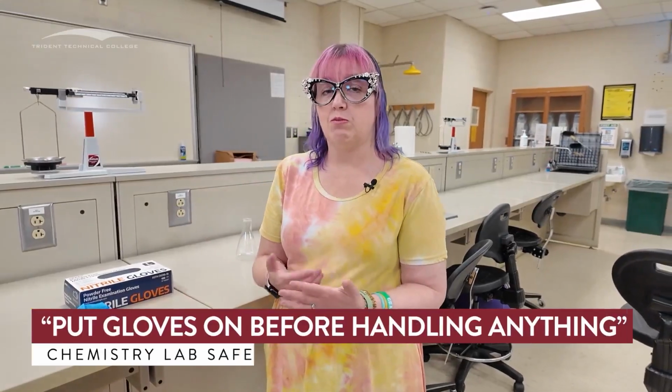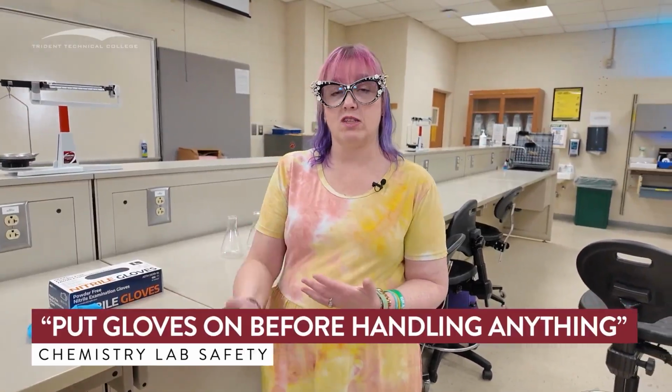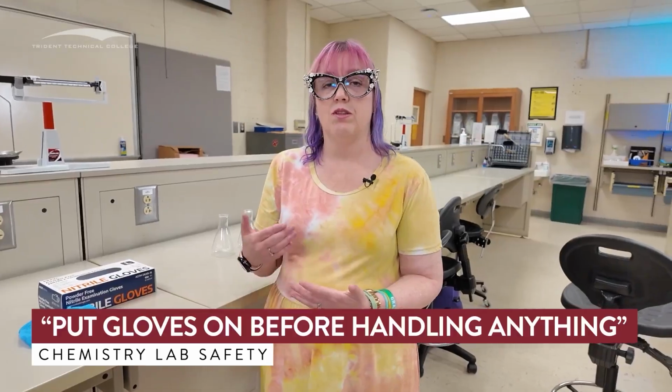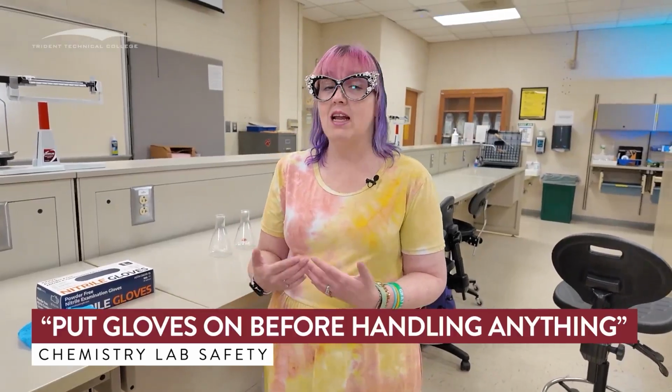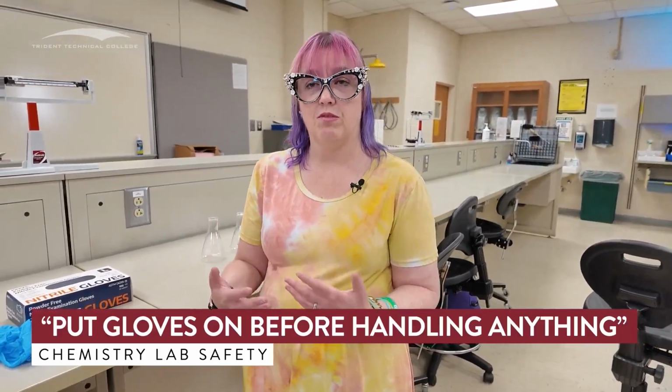Now, things that we need to make sure that we're dealing with when we talk about these experiments. We put those gloves on before we handle anything, because you may not be the first lab for that week. So the things that we're dealing with may not be as clean as we want them to be. So we want to make sure that we're dealing with everything in gloves. Anything that we deal with in the lab needs to be done that way.